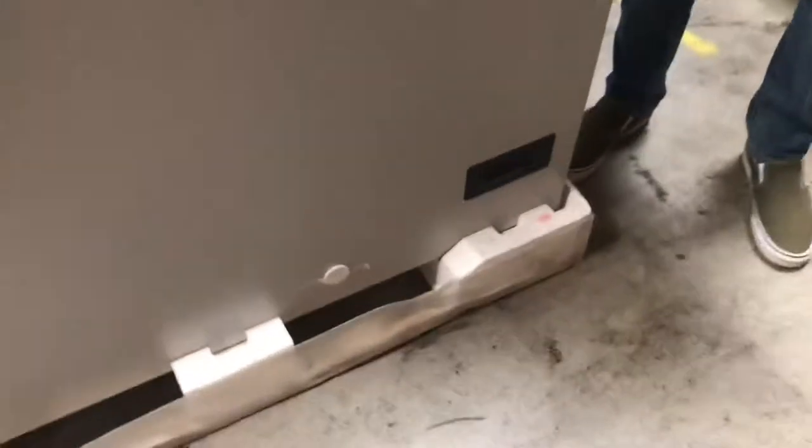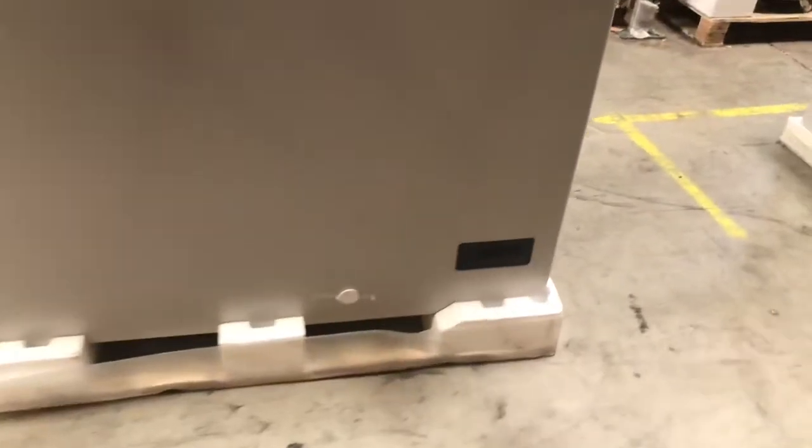Also in this unit there will be a drain. If you take a look, it's right there inside — it will come out through the front of the unit. Also in the front there is a temperature panel for this unit, so you can control the temperature right there and it will also display your temperature.